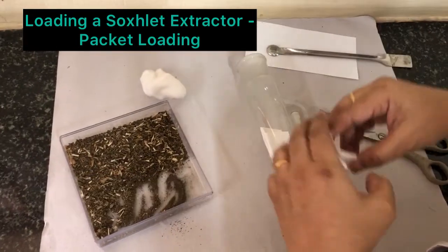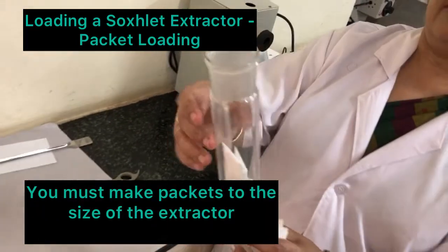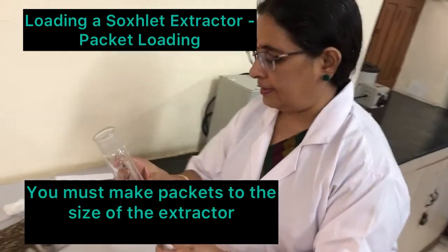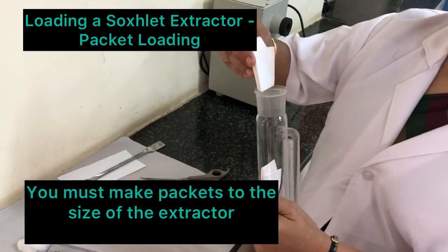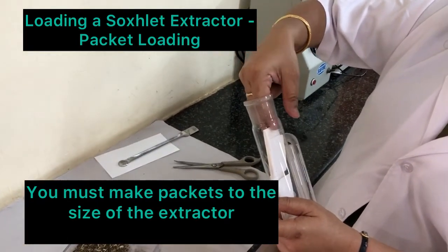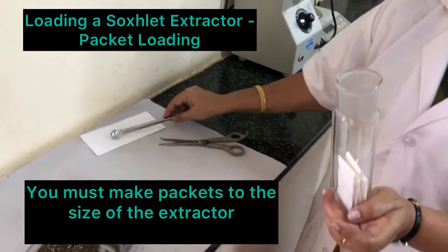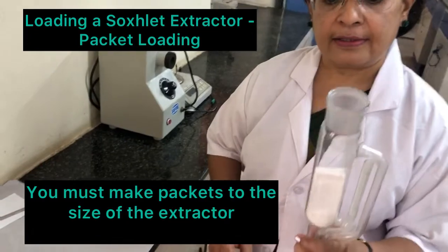Similarly you can fill other packets. In a Soxhlet extractor of this size, you can fill almost four to five packets. You have to put them in such a way that the bigger fold is downwards like this. Then try to push it down. Small amounts of powdery plant material you can extract like this.